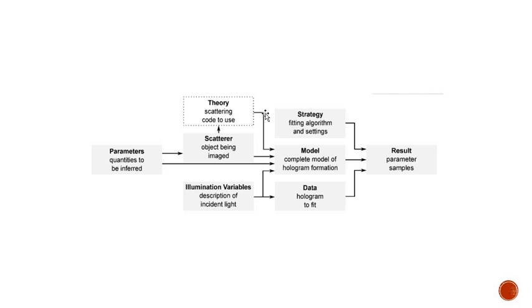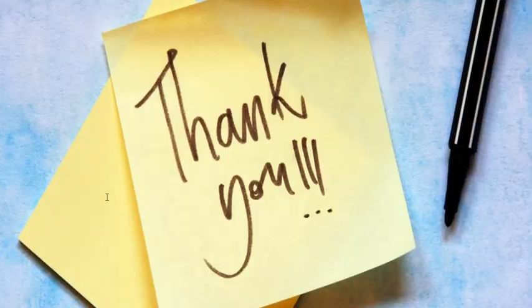To extract data from the hologram, we have to have parameters and theory, and we have to see the illumination values, which are then written into a fitting algorithm to find the data and the model for the hologram formation. We have to take the hologram to fit the data, and the results of the samples should be provided. This is a small code showing how it should look.